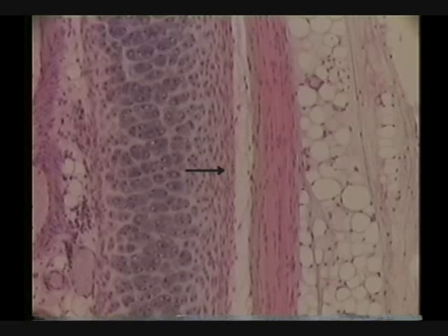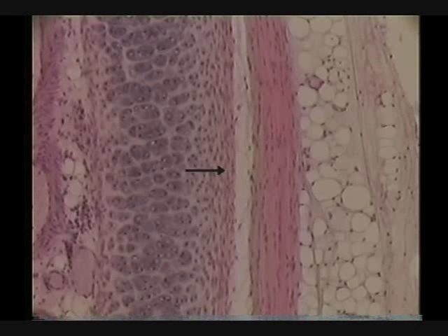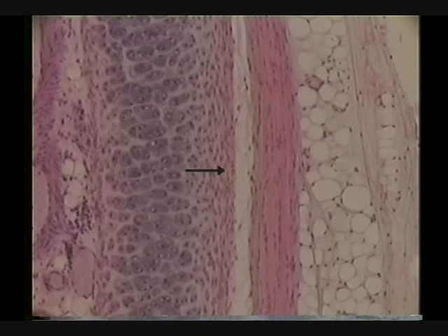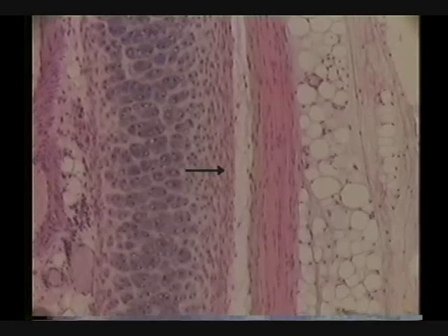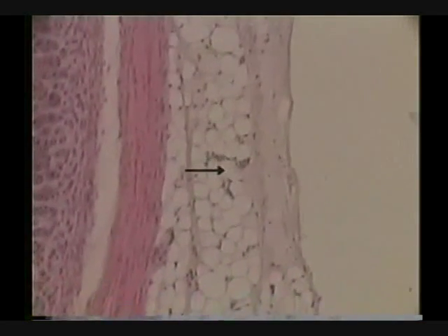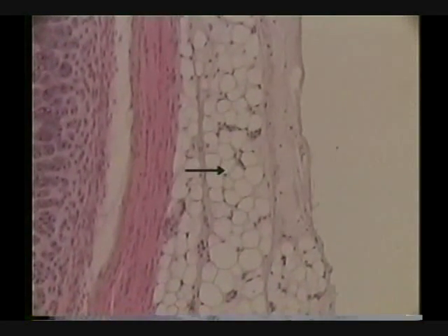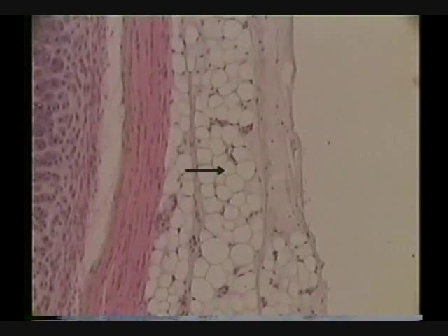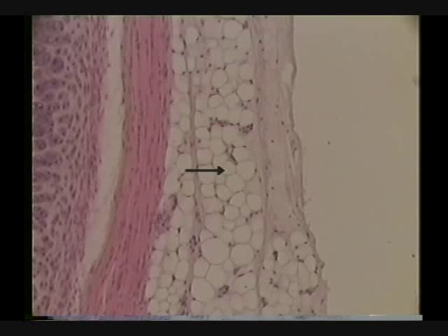Identify the tissue indicated by the pointer. The tissue is dense white fibrous connective tissue, irregularly arranged. Identify the tissue indicated by the pointer. The tissue is adipose.